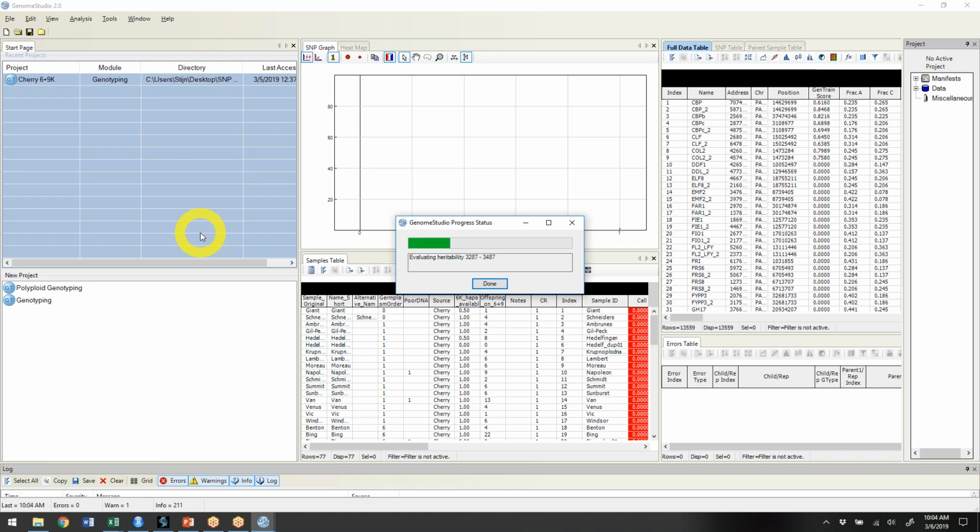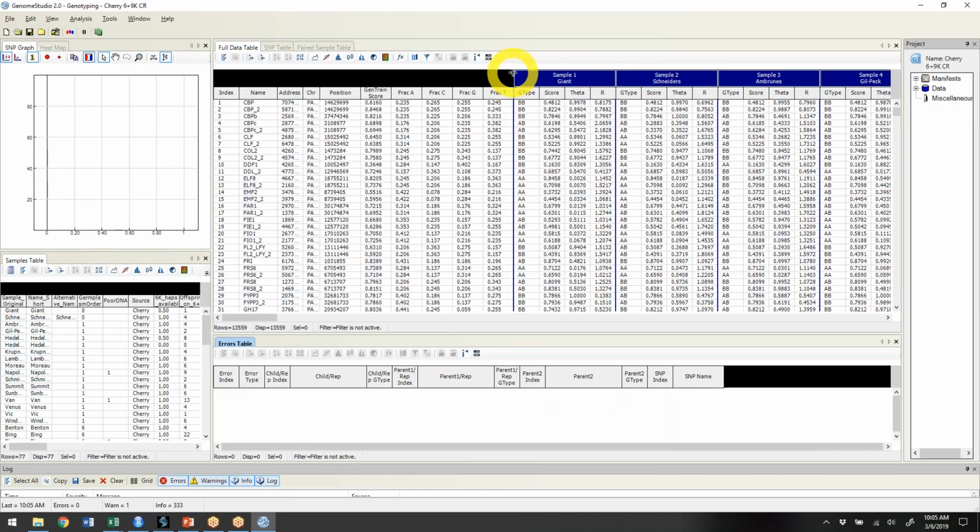So every time, where you identify where the sample sheet is, or where you say where the data is, it will remember that. So when you redo this, you can more or less just hit next without having to change much. And I haven't had it go wrong two times in a row. So I hope this is working for everybody. And if it isn't, then I hope that the second time it will work.